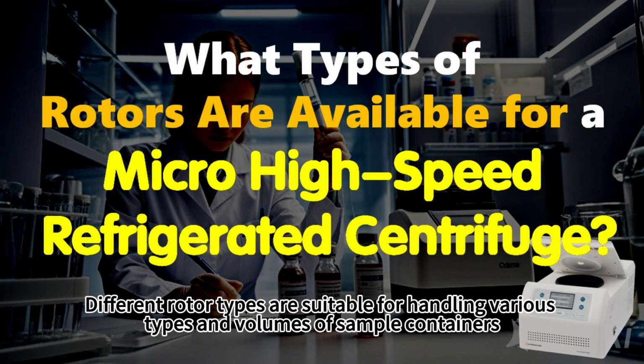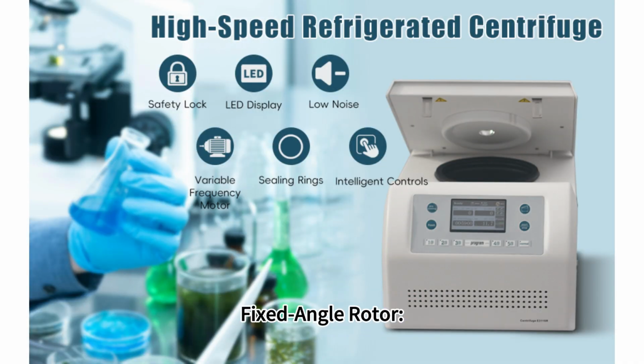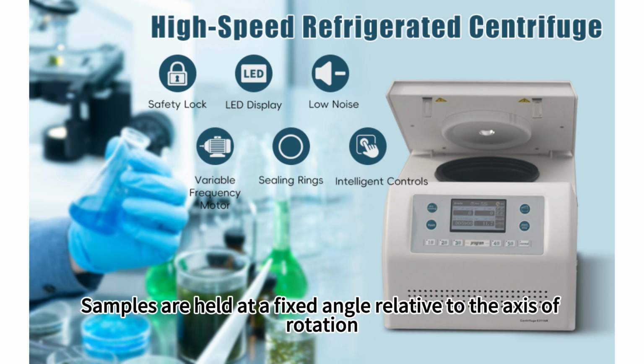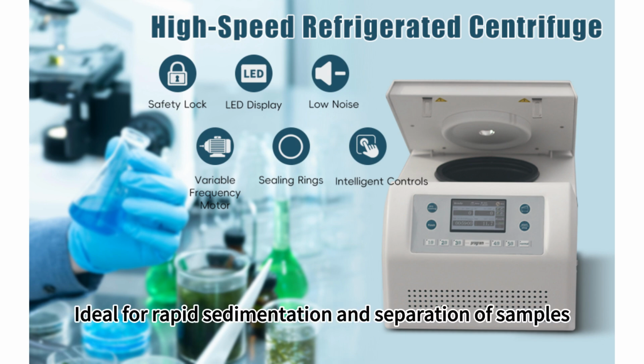Different rotor types are suitable for handling various types and volumes of sample containers. Rotor types: fixed angle rotor. Description: samples are held at a fixed angle relative to the axis of rotation. Suitability: ideal for rapid sedimentation and separation of samples.